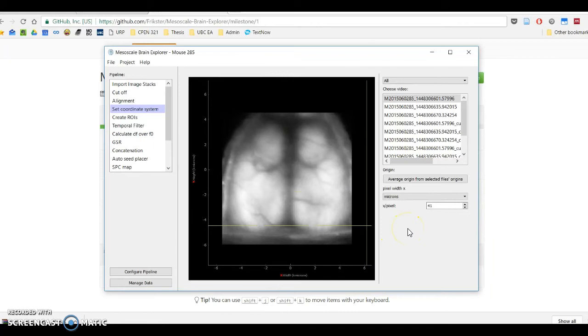and the correct origin. Note that at this very moment, selecting millimeters or microns all it really does is change the X and Y axis. This is because mathematically, as I'll explain a bit later, it cancels out when you import your particular coordinates. If you use the same units for whatever you're importing, it doesn't really matter that you specify what the units are over here.